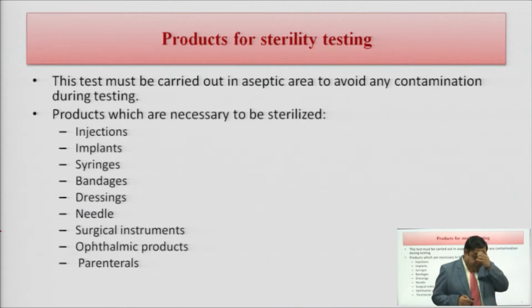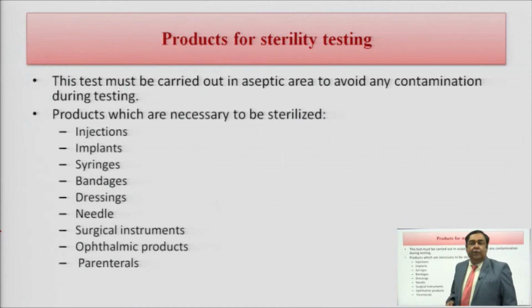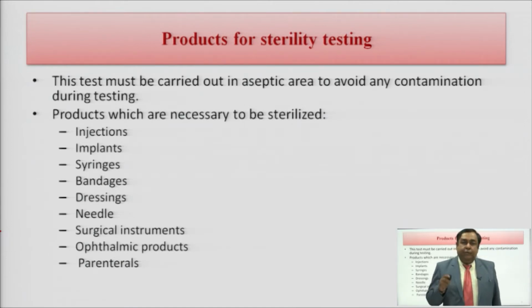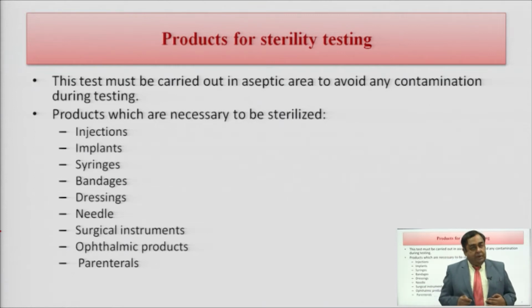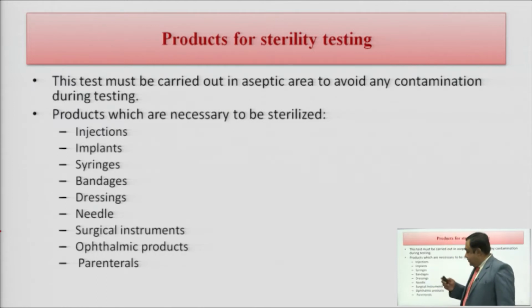The only precaution which you need to take during this test is that the test mandatorily needs to be carried out in an aseptic environment, so that there is no contamination during the testing procedure. Whenever you are doing the test, you have to be very sure that the media and the area where you are carrying out the test have no presence of bacteria. That is, the environment is aseptic. So, this test must be carried out in an aseptic area to avoid any contamination during testing.